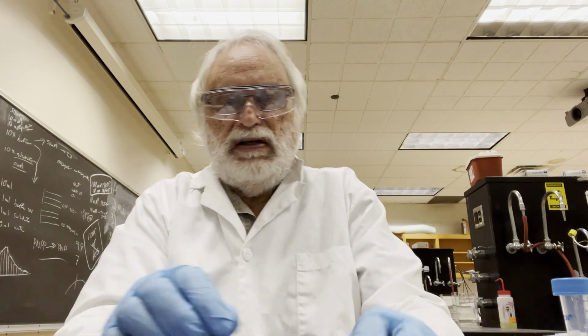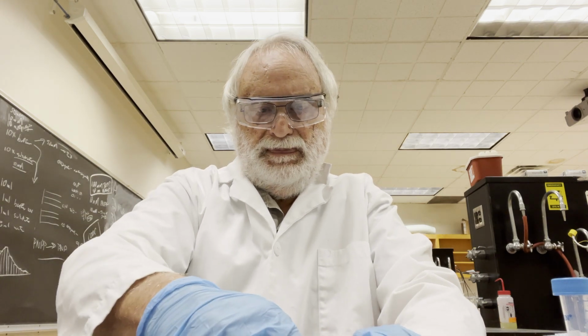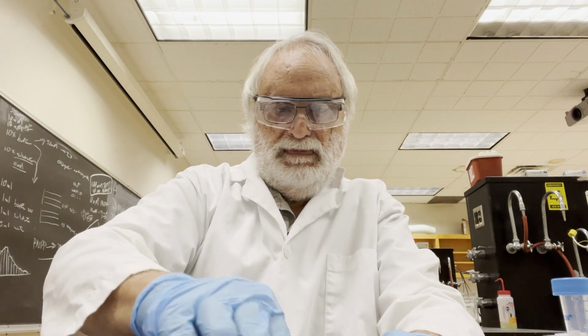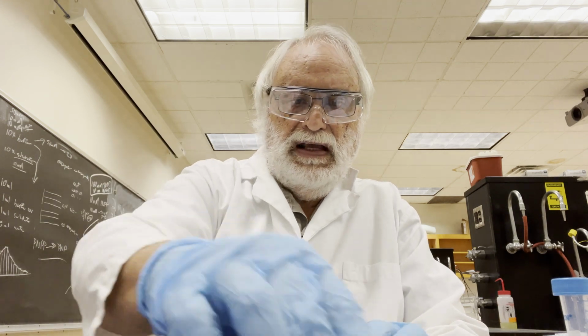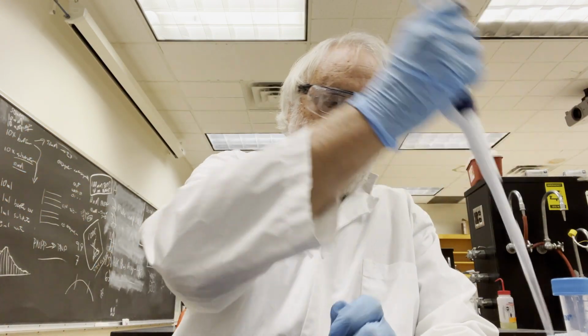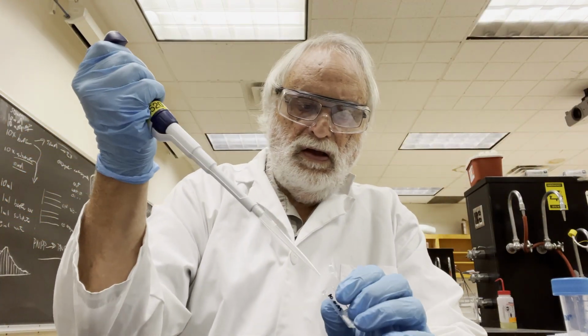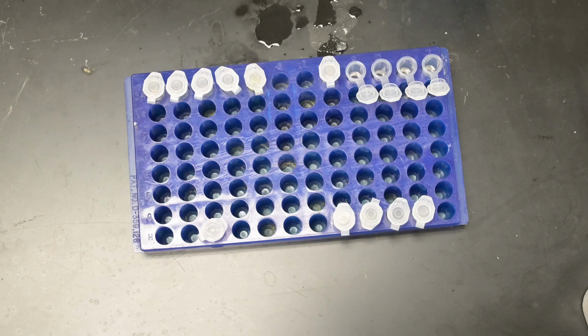So what I'm going to do now is open up all these tubes. I don't need to add the last one because there's 2 milliliters in here. And then I'm going to transfer the contents of this tube into this tube.